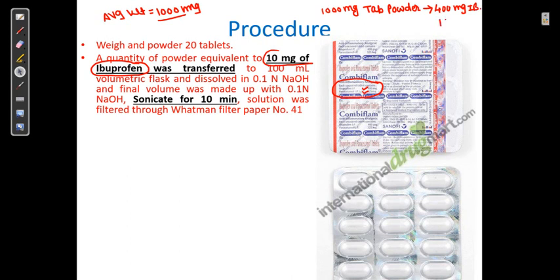We need 10 milligram of ibuprofen, so how much tablet powder is required? We need to crush it.